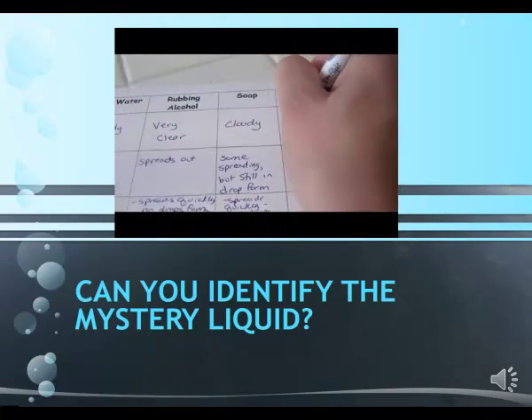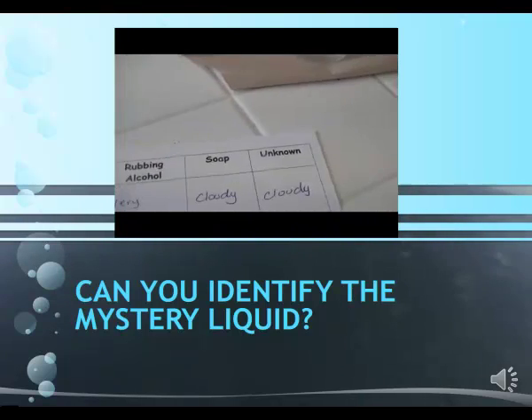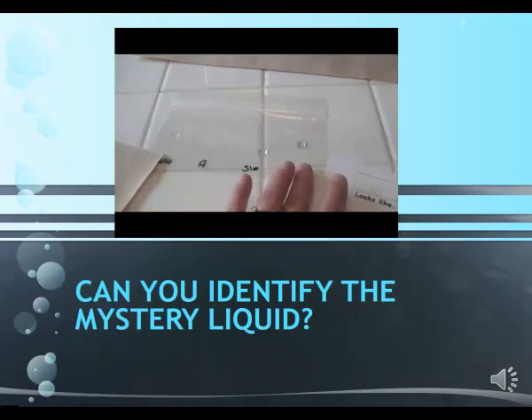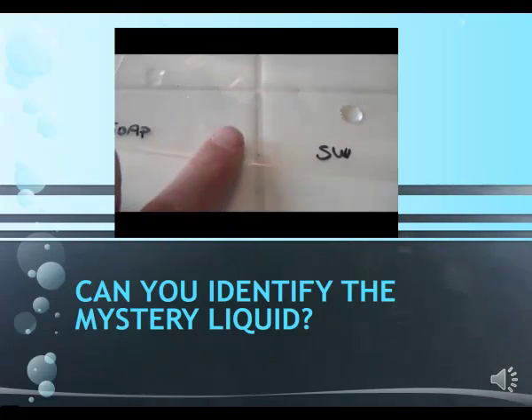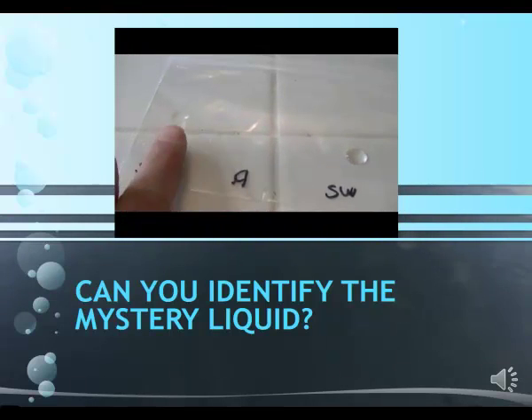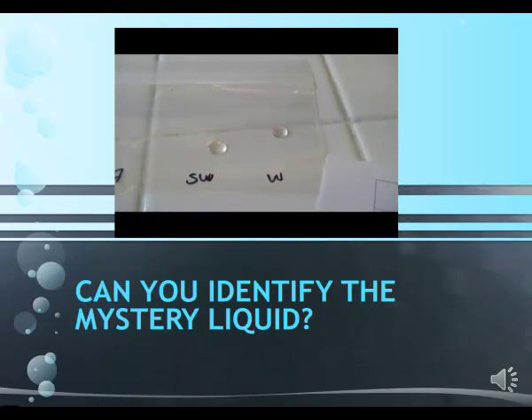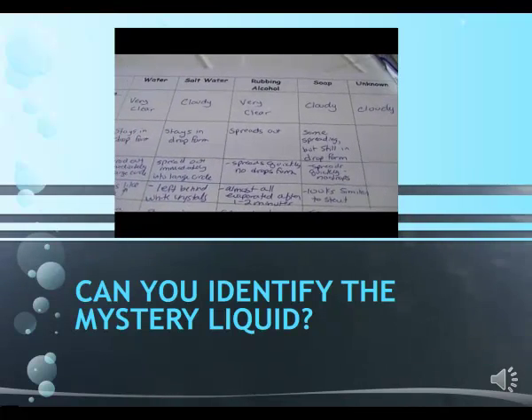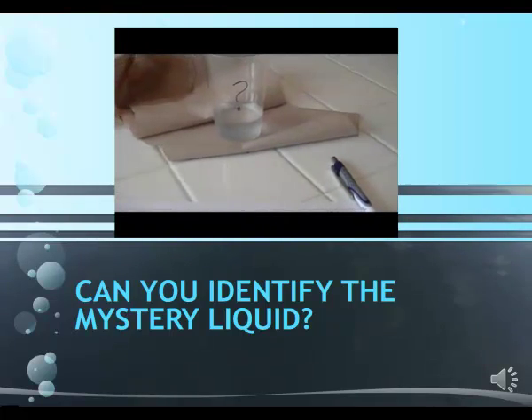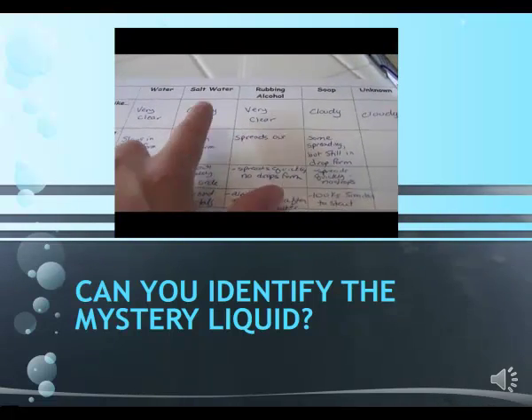I'm just going to write in cloudy. So the plastic bag test. Bring that back. Oh wow, look at this. We did this test a while ago, and you can still see the results, although the alcohol one seems to have evaporated again. Soap is still kind of in a spread out way, but salt water and water are still nice and beaded up. So what would I assume? If my hypothesis, just by doing a visual check on this slightly cloudy solution, I would think it's salt water or it's soap.